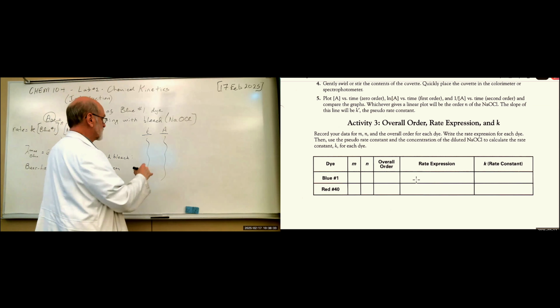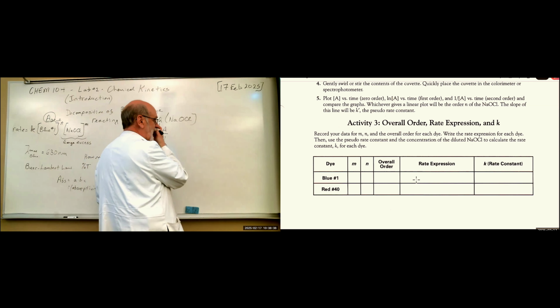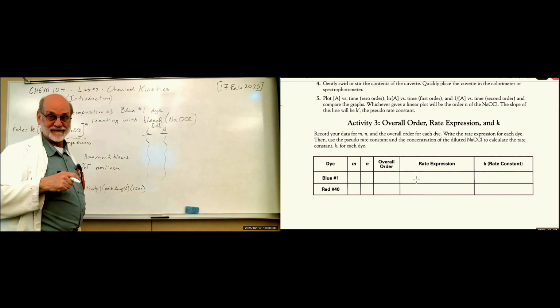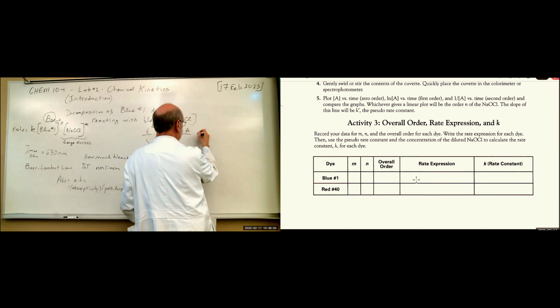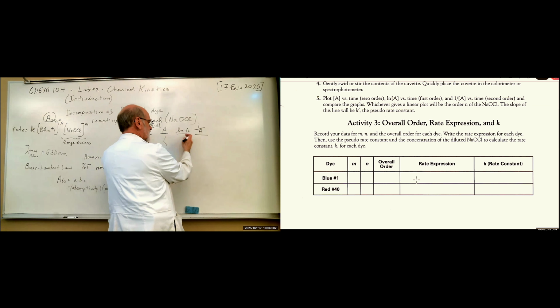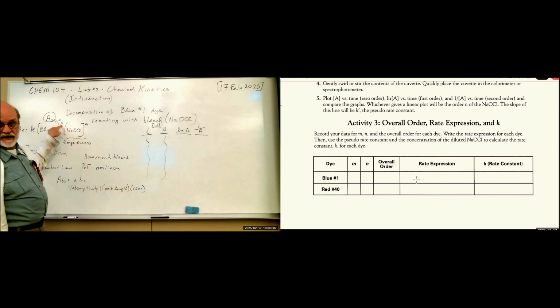Okay, for the full strength bleach, how do we determine the value here? Okay, we need to plot time against absorbance, time against the natural log of absorbance, and time against 1 over absorbance, and see which one of these is linear. That will tell us that value right there.